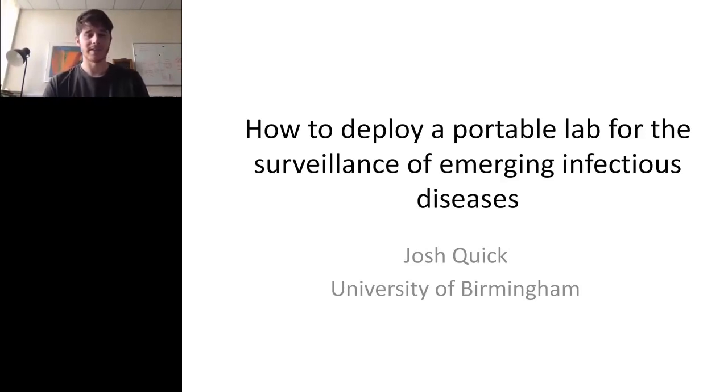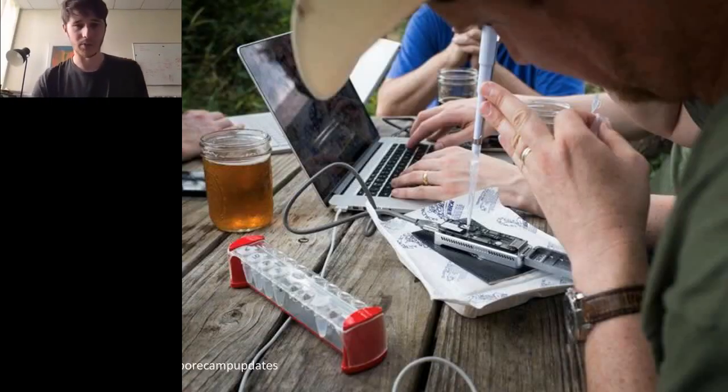Previous generations of instruments were quite large, around the size of a photocopier or maybe a laser printer, but they weren't very portable. Whereas the MinION, because of its technology, doesn't have any moving parts. It means that it can actually connect to a laptop computer, and it's only really the size of a USB stick.